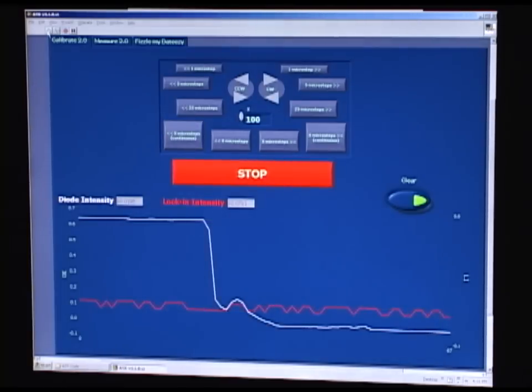Once a mode is found, the motor needs to be fine-tuned so that it rests at the angle which corresponds to the lowest point in the diode intensity or the lowest point in the trough. At this point, we then want to adjust the laser and wet spot to gain the maximum signal or to increase the amplitude of that trough corresponding to a mode.